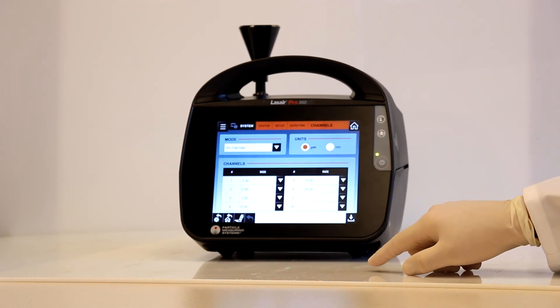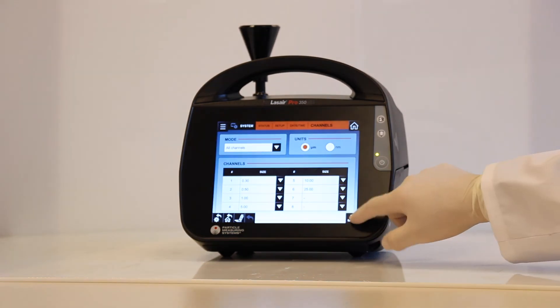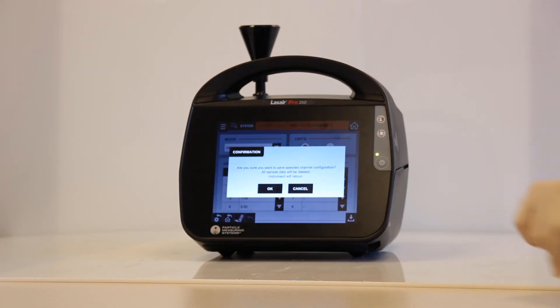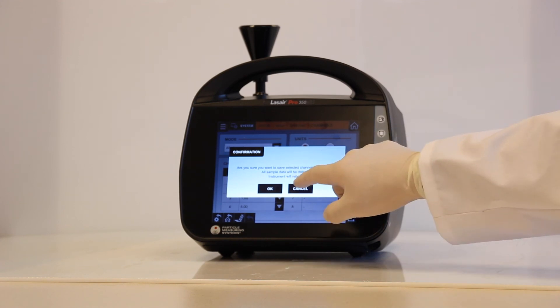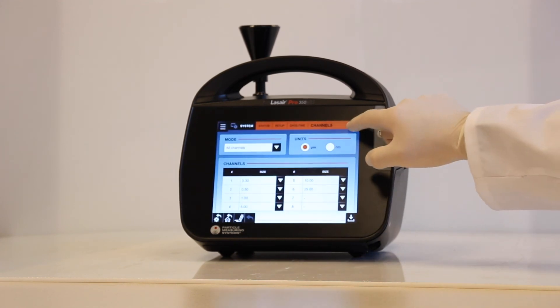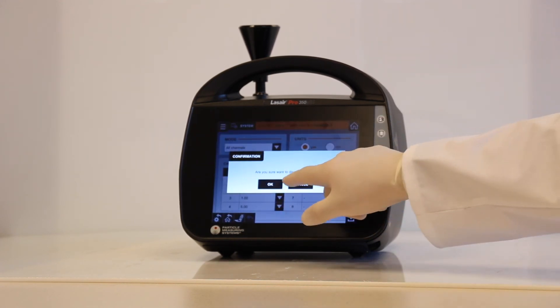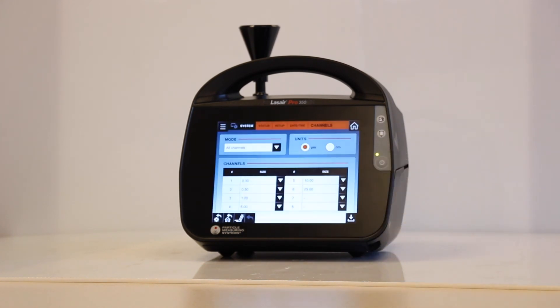After you have the unit configured to your desired settings, simply select the download icon in the lower right corner of the unit. A confirmation dialog will appear. Select OK and the updated settings will be saved into the instrument.